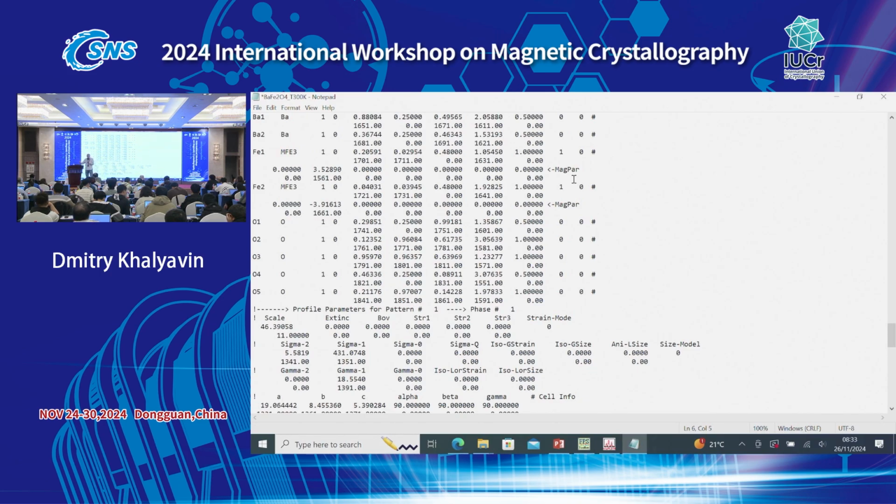You can refine all of them, and I just wanted to show that yes, you can refine all of them. But of course, you need to decide, because even in this case we probably didn't need bank 110, because our model and our data don't have any Bragg peaks at very large d-spacing.